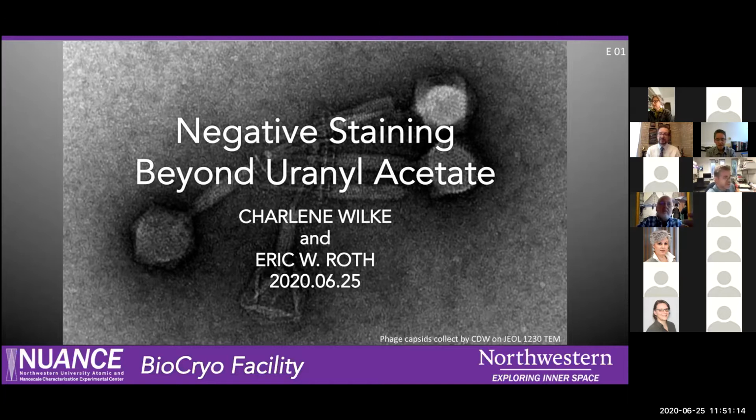Charlene, you want to say anything about that? No, I agree. Yeah, Brian, I'm not sure. It might be a question of getting the solution right to that point where it starts precipitating, and I could think with something, let's say iron chloride, it might be much more difficult to keep the solution right at that point where it starts to precipitate.